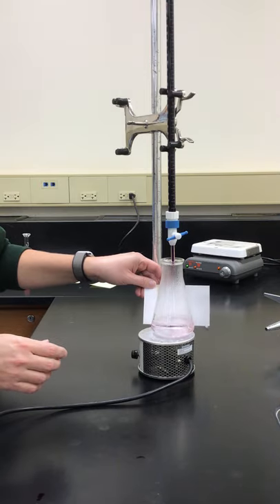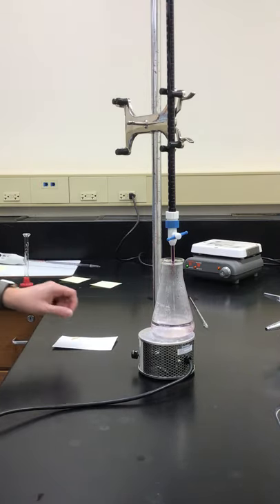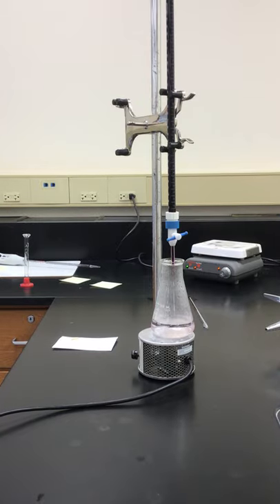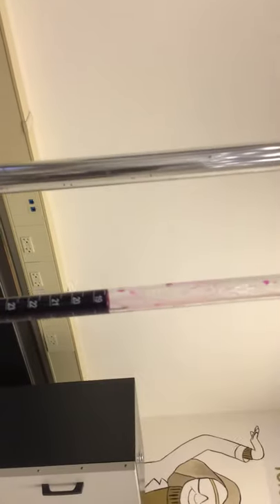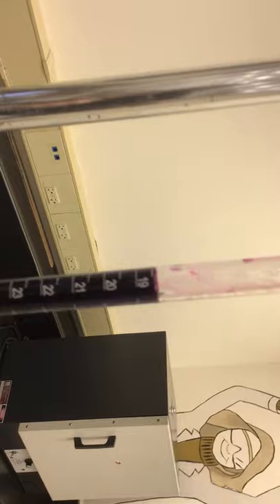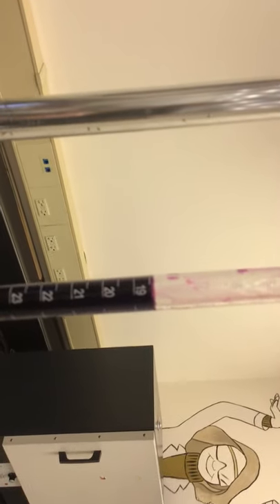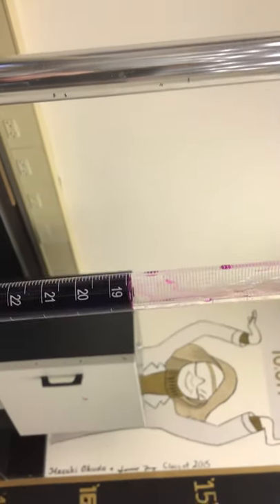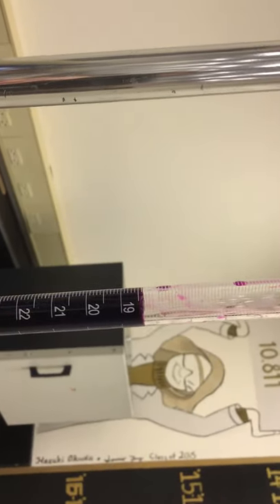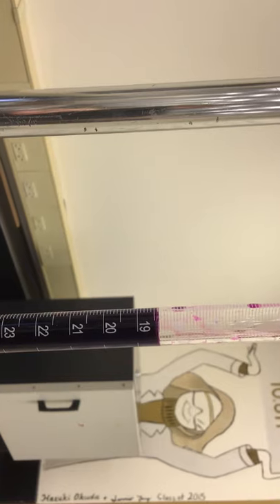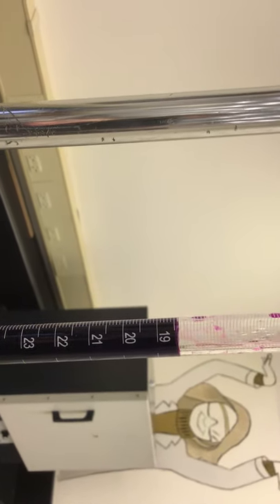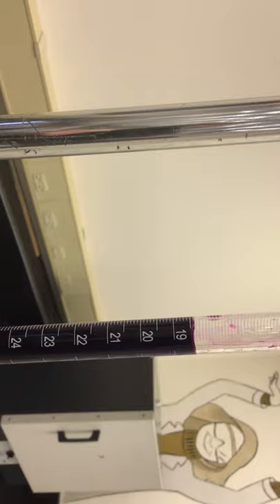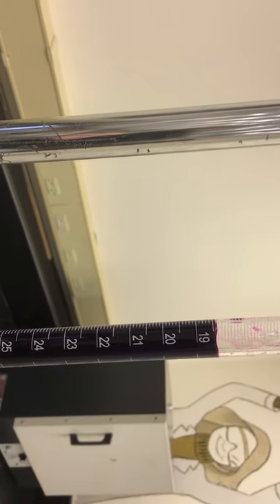And so now I'm going to take a look at my burette reading. And I'm going to take a picture of this for you guys. And now you'll be able to figure out the exact molarity of the potassium permanganate.